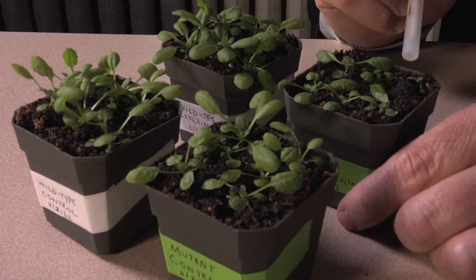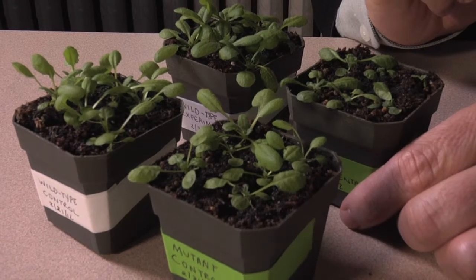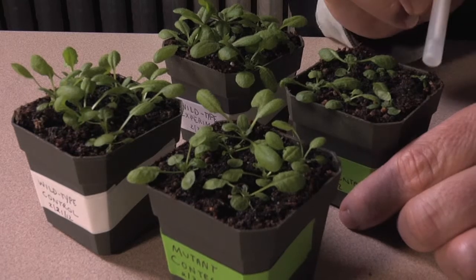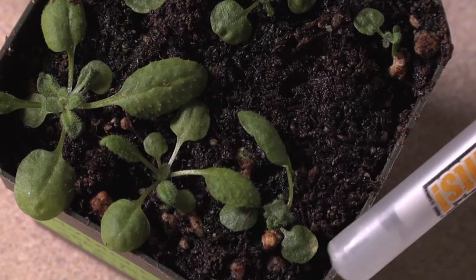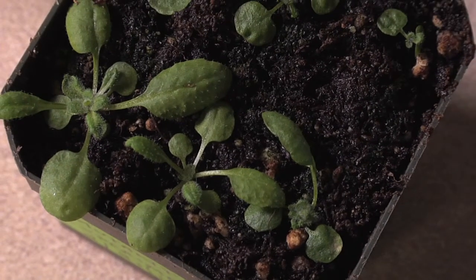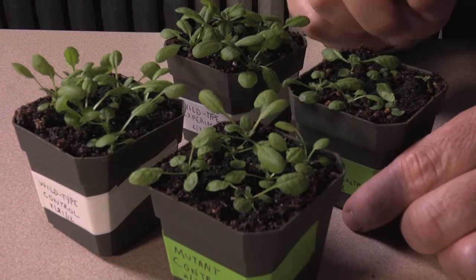They're a lot worse off than the mutants under control conditions were. They don't seem to be thriving as well, and I can see that for many reasons. Over here I can see that on the surface of this leaf, not only does it have that wavy pattern and is it smaller, but it has a dead spot, a brown lesion on the leaf that has appeared.